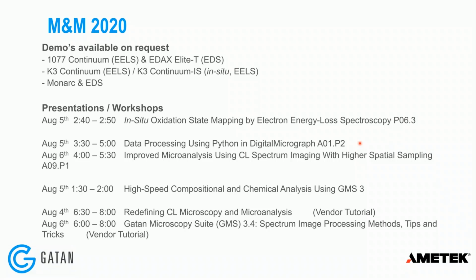Yeah, sure. I think we have time for one more question, which just came in, asking about sensor damage. In the initial slide, when you were talking about direct detection, you said the one drawback of direct detectors is that they can be damaged. And the question was about the comparable lifetimes of direct and indirect sensors. Can you comment a little bit on that, or I could take that question?